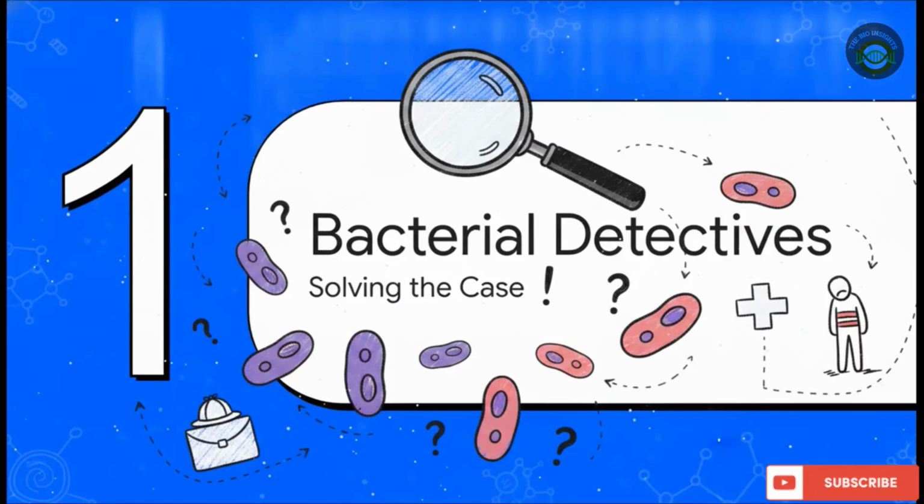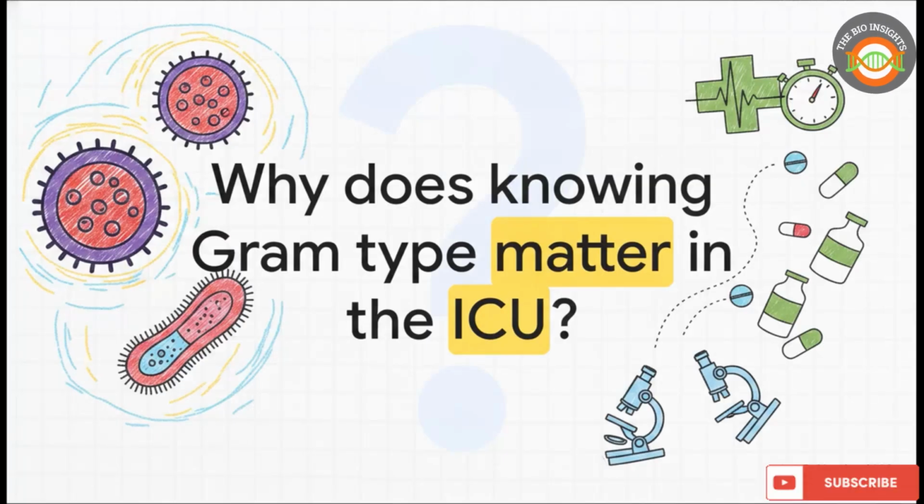All right, part 1, the bacterial detective story. Imagine you're a detective in a hospital dealing with an unknown infection. A patient is incredibly sick, you have multiple bacterial suspects, and you need a quick clue right now before it's too late. So why does knowing if it's gram-positive or gram-negative actually matter in a high-stress place like the ICU?